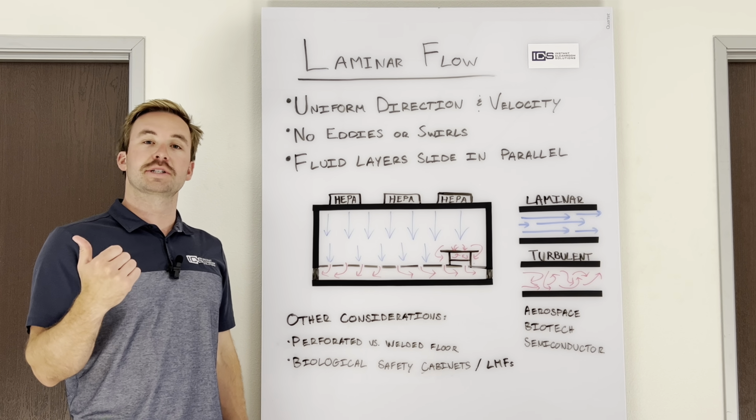In particular, industries that need to comply with pharmacy regulations and FDA CGMP regulations. Perforated floors don't comply. They're not easily cleanable. And so for those applications, you're going to need a welded vinyl floor. It's a flexible material. However, there's no breathability in this. We'll cover your whole floor with this, and we can cove it up the walls so that it's easily cleaned. There's no corners. So if this whole floor is covered, then there's no room for air to flow.